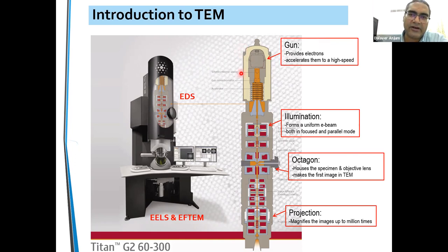So basically, you have that electron gun here, which gives you electrons. It gives you an electron every nanosecond or earlier, that's fine. But each electron comes only one time. No two electrons can come from the gun at the same time. That will be a violation of the uncertainty principle. So that's basically how the electrons are coming.